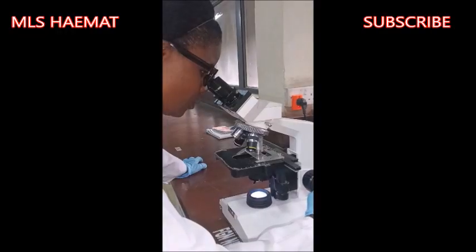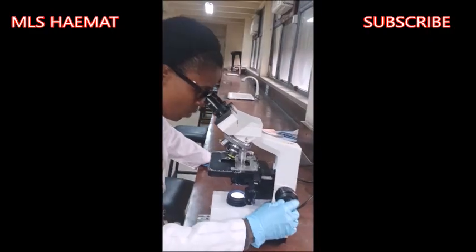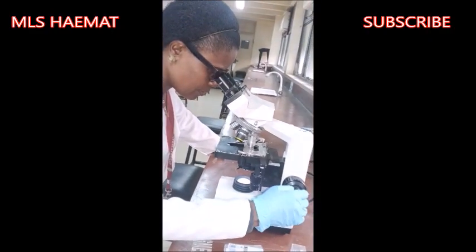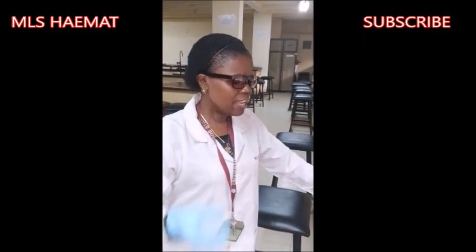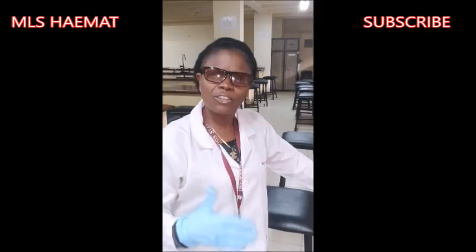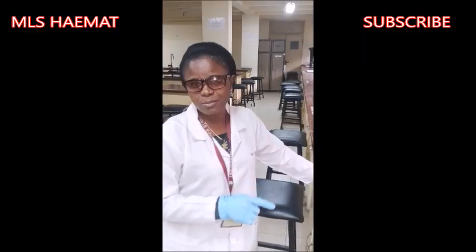Then with the fine adjustment, I'm still going to move the fine adjustment forward. I'm not moving it towards myself now. I'll move it forward. And now I have my red cells in focus, and that's all. I am done with the focusing. If you try this method, believe me, trust me, you're going to get it right. So that's how to focus wet prep under the microscope.